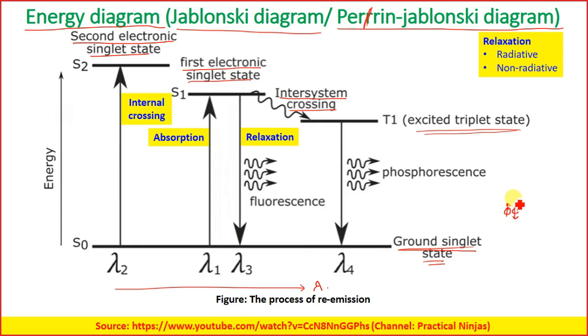If one is moving clockwise, the other will be moving anti-clockwise. Let us represent them in this fashion. When they are moving in opposite directions, that is called the singlet state.